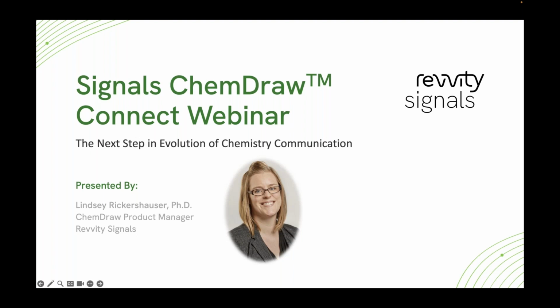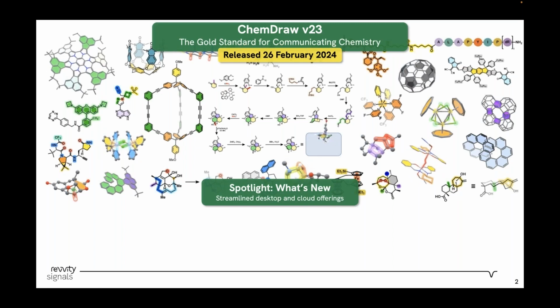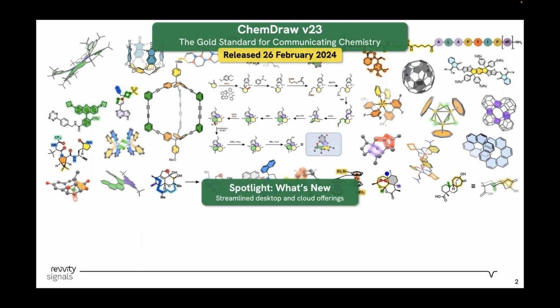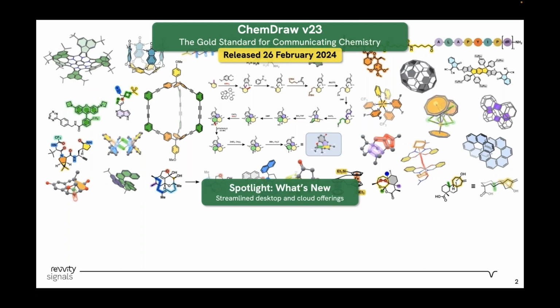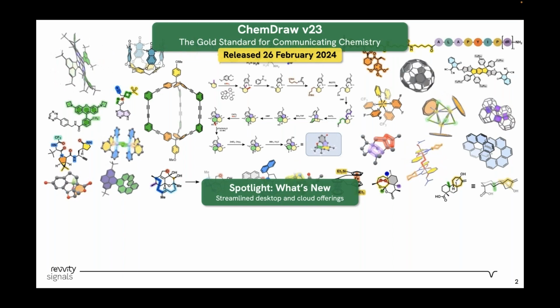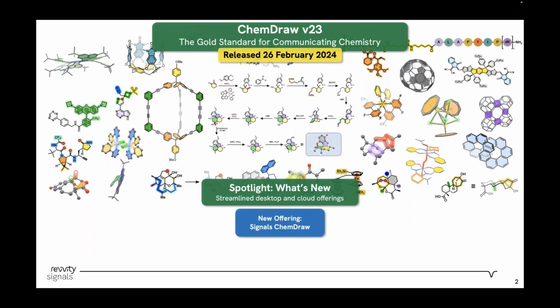Okay, so the main topic of today's webinar is around the ChemDraw version 23 release. So if you have not heard, we released ChemDraw version 23 on the 26th of February this year. So today I'm going to spotlight all of the things that are new as part of this release. So what is included in that?